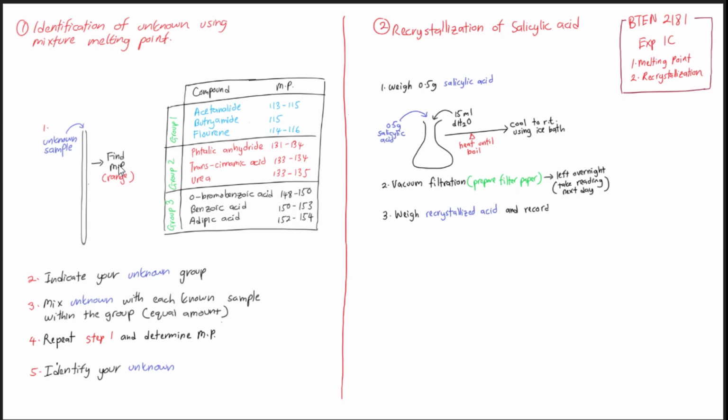You will see through this virtual experiment, and I want you to decide when the crystal starts to melt and when everything totally melts. You will do the report based on that. We will show you later on. You will look through the machine, decide yourself, and then do the report on that. So that is the melting range, basically. You need to have the starting temperature and the end temperature.